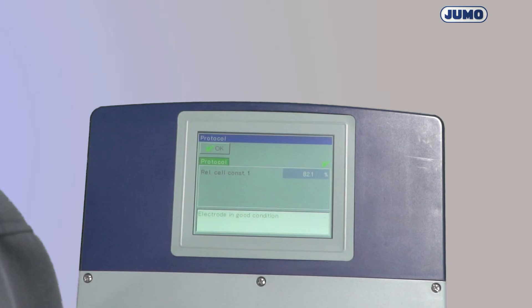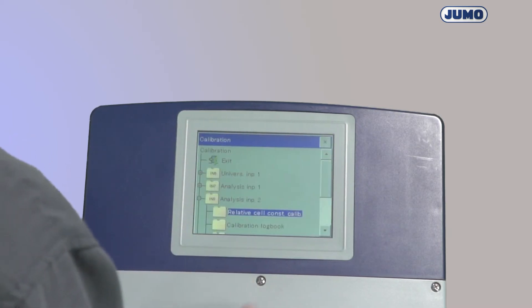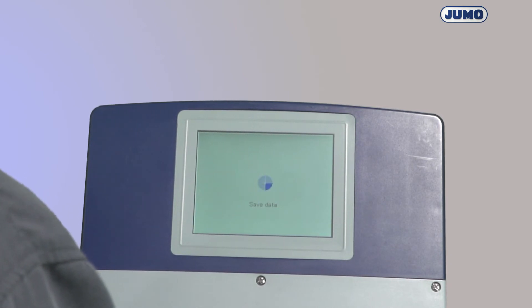This should be in a range of 80 to 120 percent. The relative cell constants of the conductivity measuring cells must be calibrated when they are commissioned, and it is recommended after the cells have been cleaned. This calibration is usually not necessary for inductive cells. I complete the calibration routine. The relative cell constant is taken by the transmitter and it compensates for the deviation from the nominal cell constant.